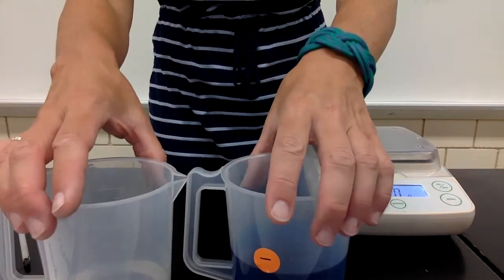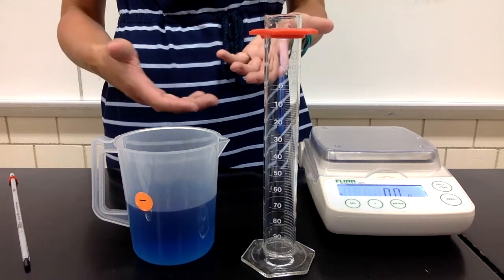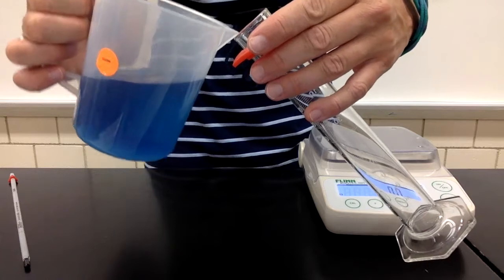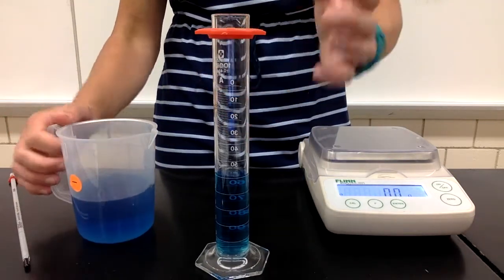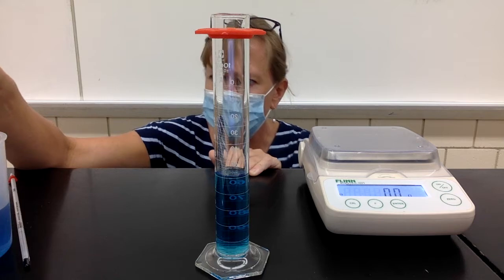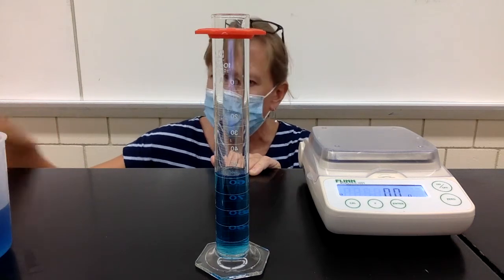The next thing I'm going to do is measure out 50 milliliters of water in my 100 milliliter graduated cylinder. I am then going to add the ethanol to this graduated cylinder, so I wanted it to have enough volume capacity to hold both liquids. So I'm going to hold the graduated cylinder at a 45-degree angle and very carefully pour some water in. And then I'm going to get down at eye level and look at the bottom of the meniscus, and I can see that it is just a little bit below 50, so I'm going to pipette a little more water in there until the bottom of the meniscus is at 50. So that's ready.